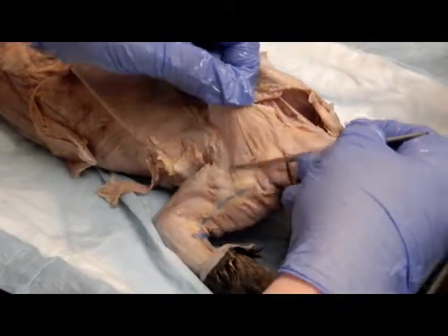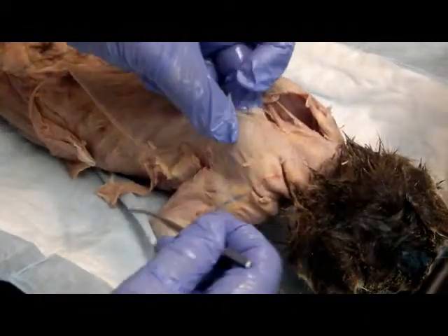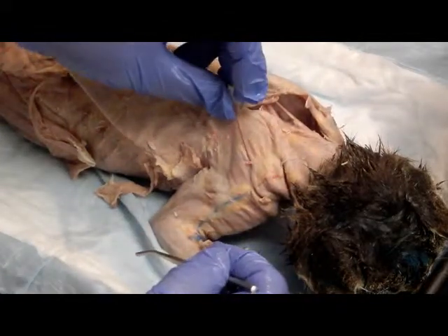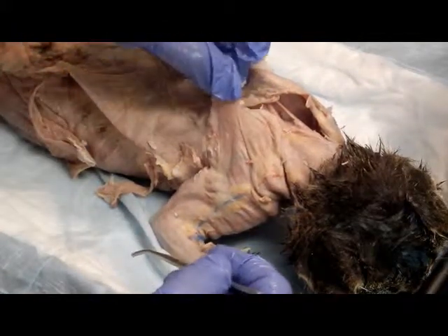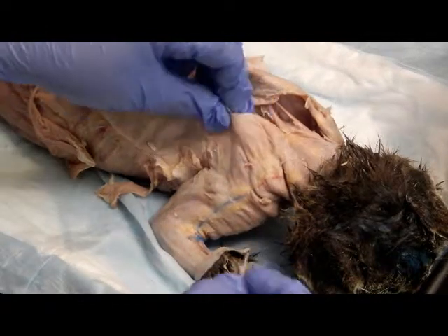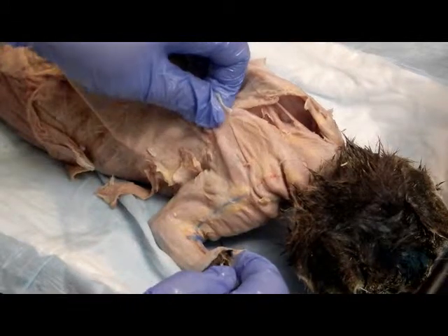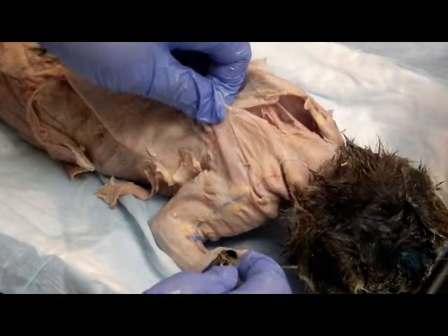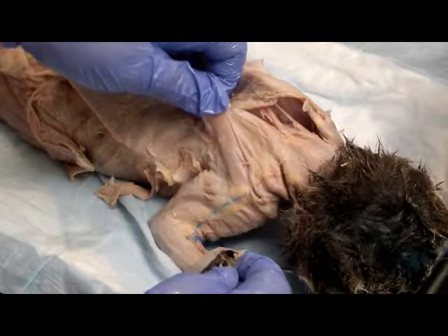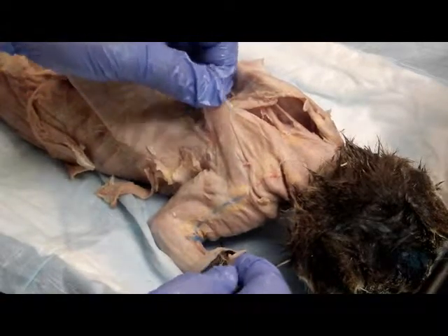This is the clavotrapezius. Its origin is the lambdoidal crest of the skull. The insertion is the clavicle. And its function is to draw the scapula dorsad, which is toward the back, and craniad, which is anterior in animals and superiorly in humans, and it shrugs the shoulder.